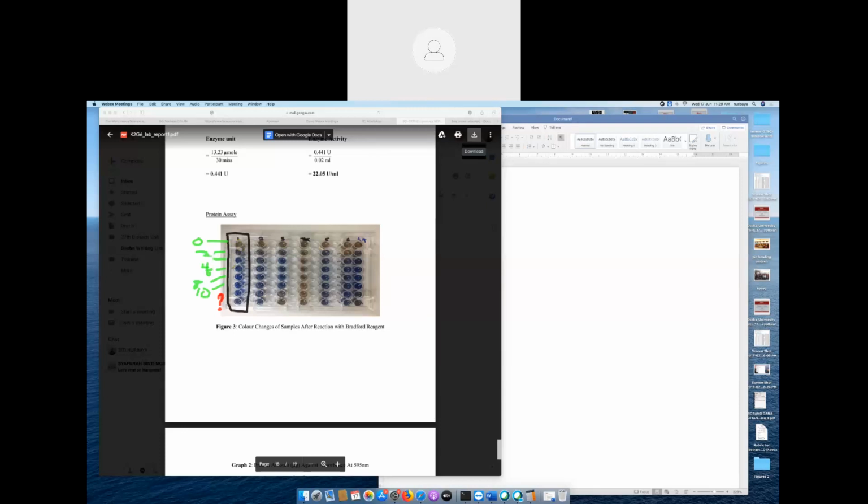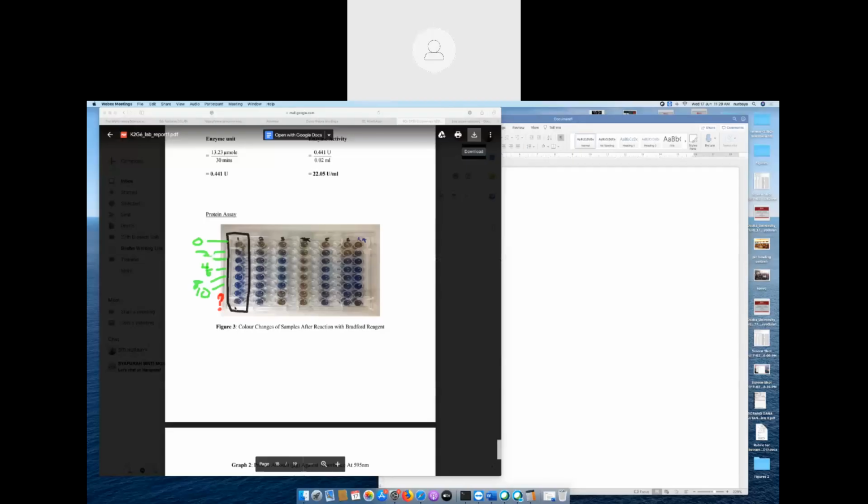Okay, now this is your standard, and then we have your sample here, which you don't know. One with 20 microliter, one with 10 microliter.